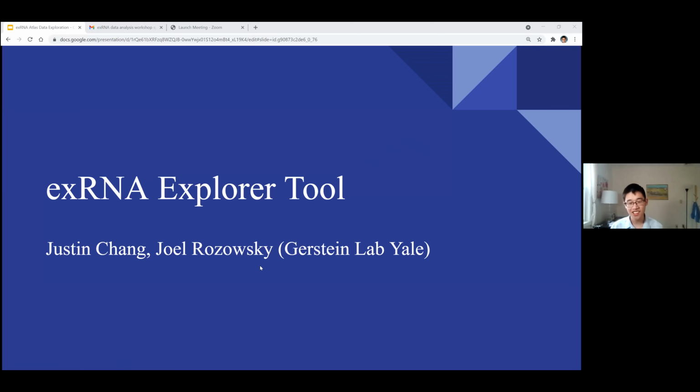My name is Justin. I'm an undergraduate student at Yale, and I've been working on a dimensionality reduction tool for exploratory analysis of the data in the exRNA atlas. I'll get started now. This will be an overview of some of the work I've been doing. It's in development, so any feedback or questions, please feel free to ask at any time.